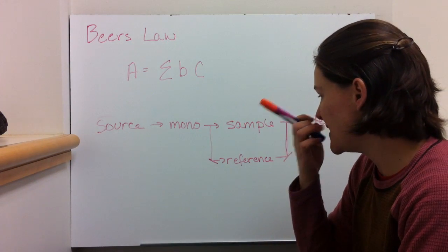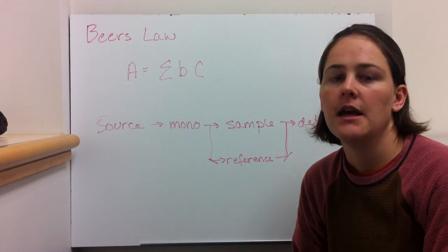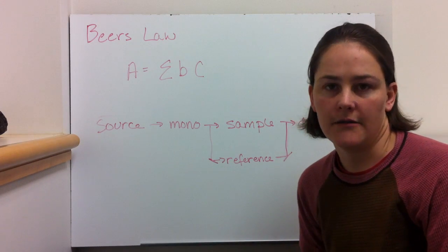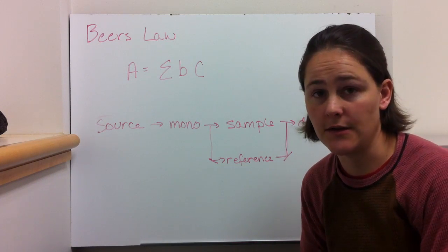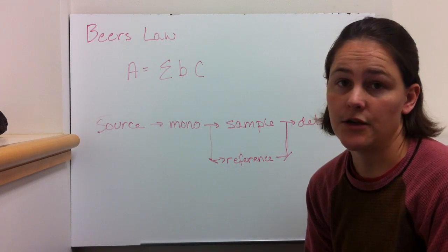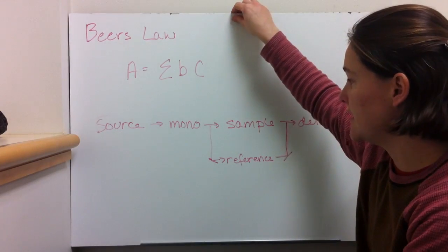But this time, we can actually increase reproducibility and get better statistics if we add a reference cell. Fancy cuvettes often come as matched pairs so that they're perfectly optically matched. So if we put in this reference cell, we can do a little bit better with our statistics.